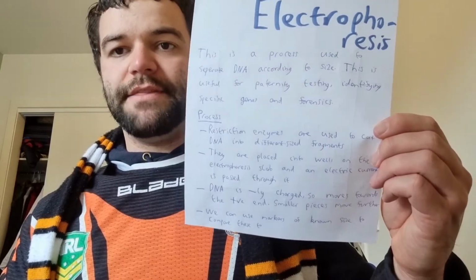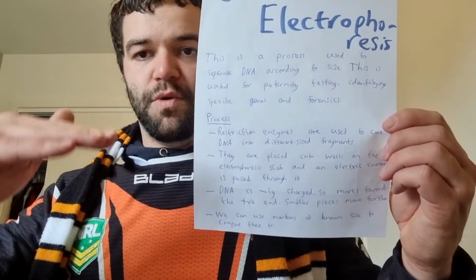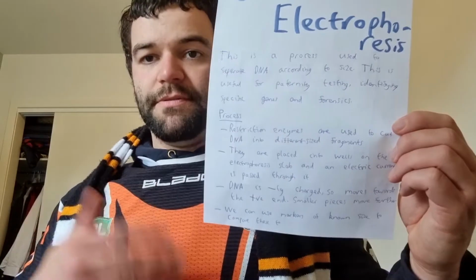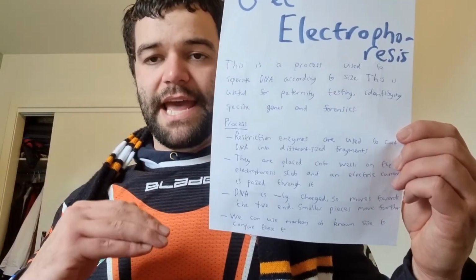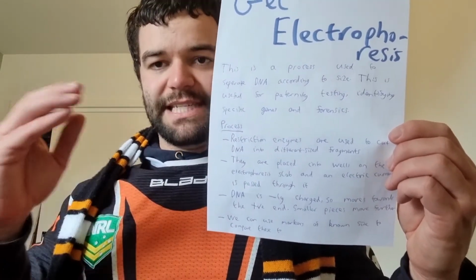And what we find is the smaller DNA pieces are lighter, therefore they move further towards the positive end of the slab as that goes. So when the process finishes, we look at the distribution of the bits of DNA, and we can say, okay, the ones that move further must be smaller, the ones that move less far must be bigger.